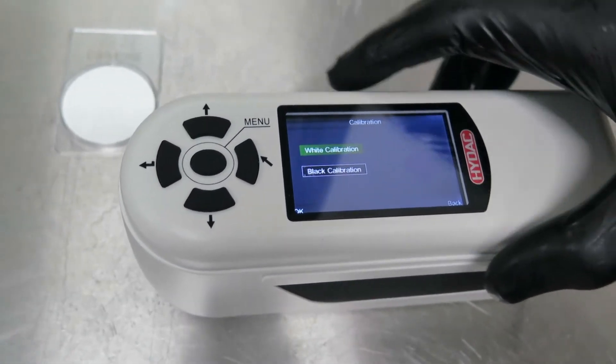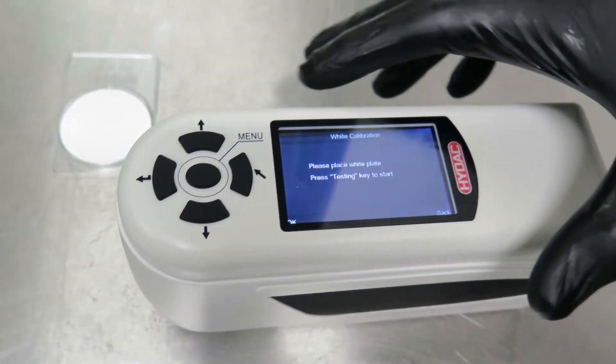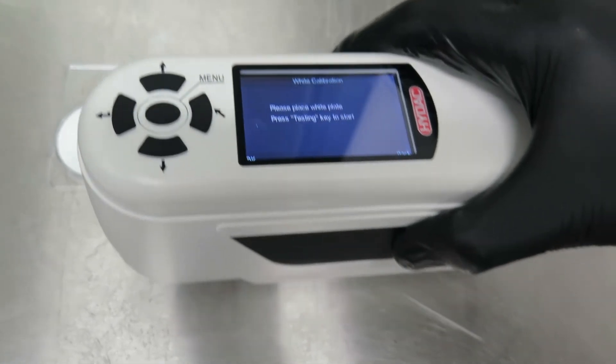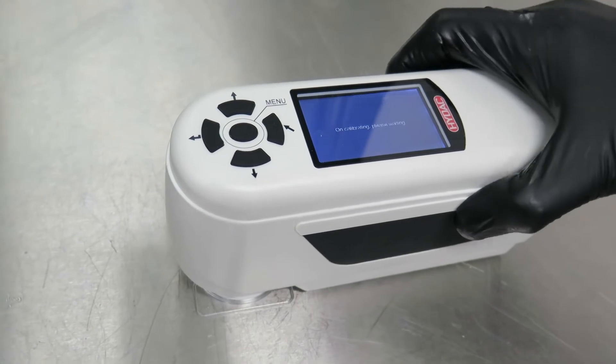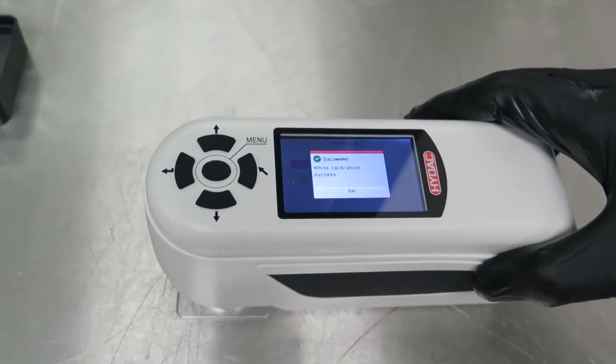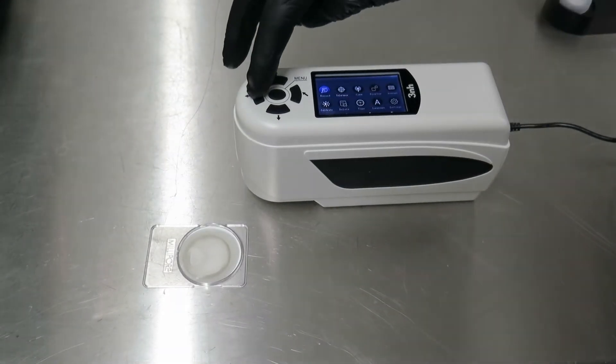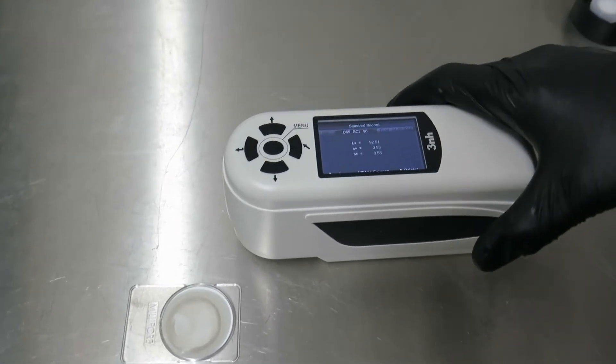It is first necessary to calibrate the analyzer to a new filter patch. This is necessary as the background color of patches will be different. The next step is to measure the color of the new oil and set up this value as the baseline or standard.